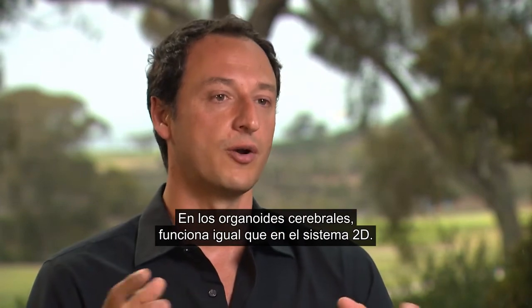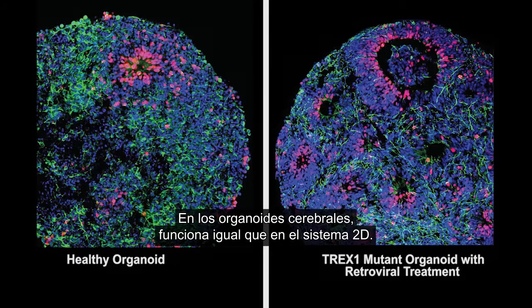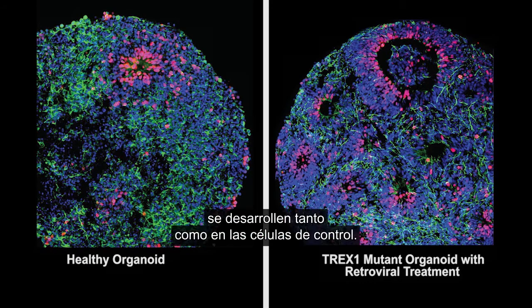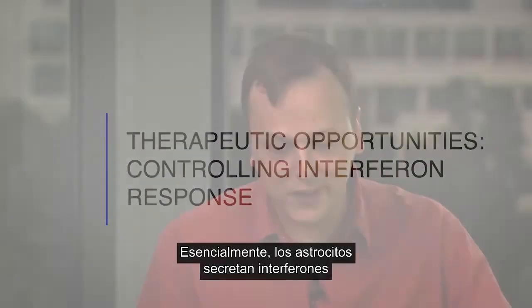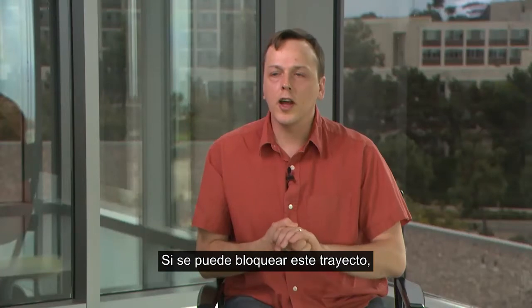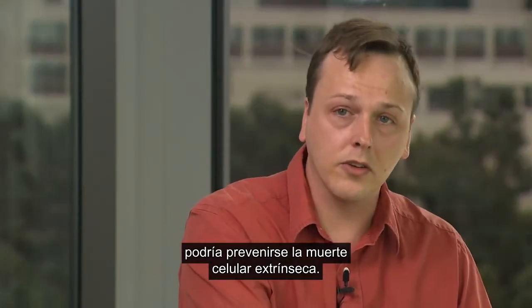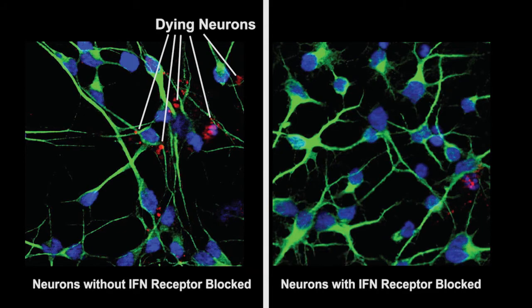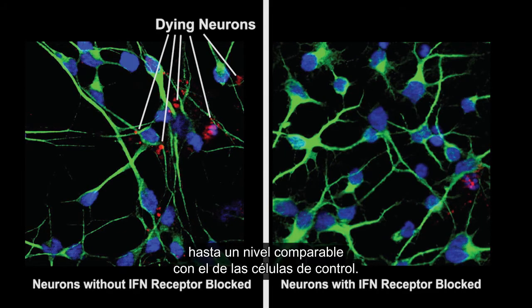In the brain organoids, it worked as nicely as in the 2D system. The antiretroviral drugs could actually make these brain organoids thrive as much as the control cells. Essentially, astrocytes are secreting interferons that are killing neurons. If you could block this pathway, you could prevent the extrinsic cell death. To do that, we used a drug that can block the interferon receptor. And by doing that, we could see the same effects. We rescued the amount of neuronal death that we see in the mutant cells to a level that's comparable to the control cells.